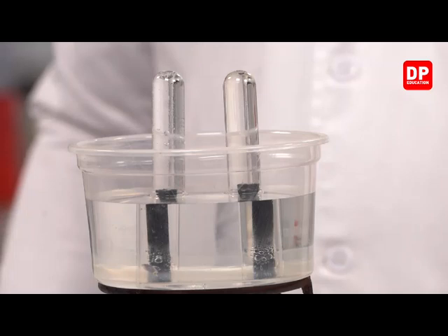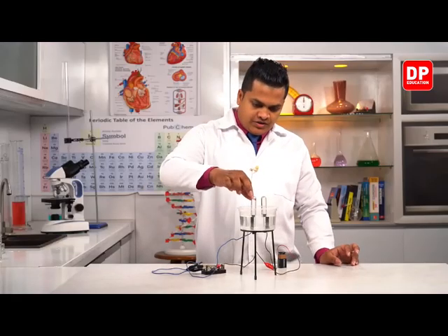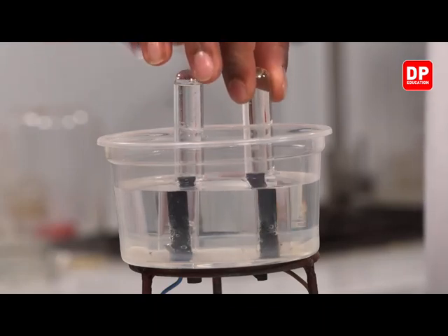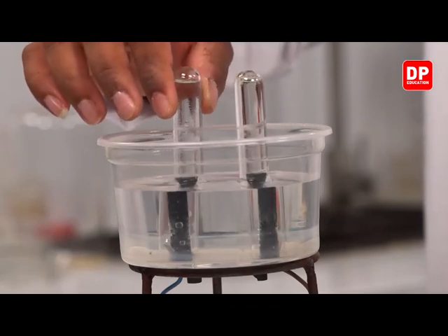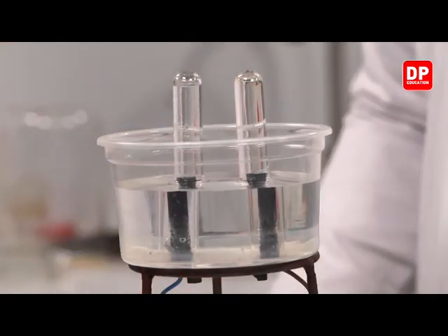So let's collect the gases, then we'll observe by adding a splinter what's going to happen. So my dear children, as you can see here, now I have moved the two test tubes in order to observe the volume of gas which is collected.